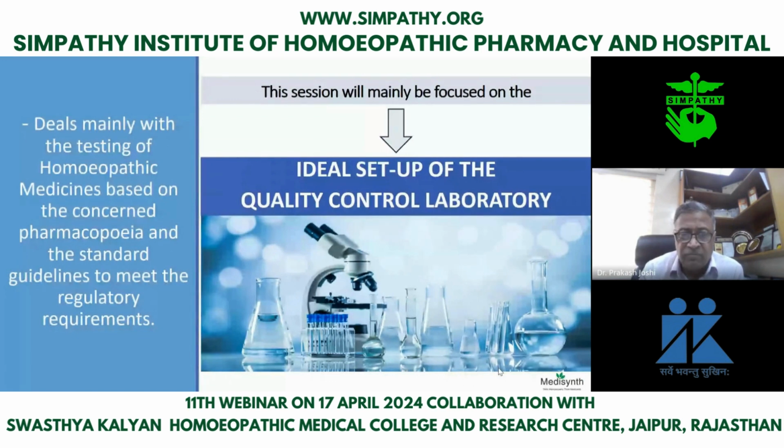For example, ipecac. When we prepare a mother tincture from ipecac, it is very important for us to find out whether it is a real plant root or not. The macroscopic characters show that there are annular rings. Again, to make it simpler, take Rauwolfia serpentina, which is called sarpagandha. The root is like a snake. On the basis of macroscopic characters, you find out whether the root looks like what is mentioned in the pharmacopoeia. Secondly, after the macroscopic characters, you go for microscopic characters.